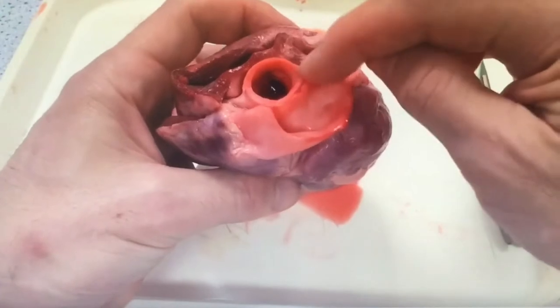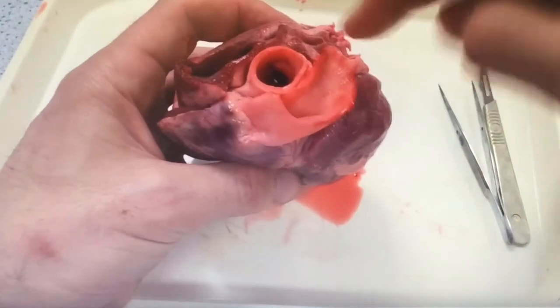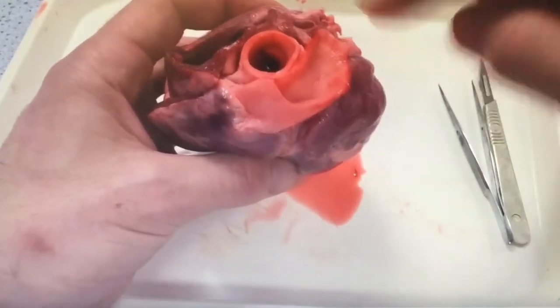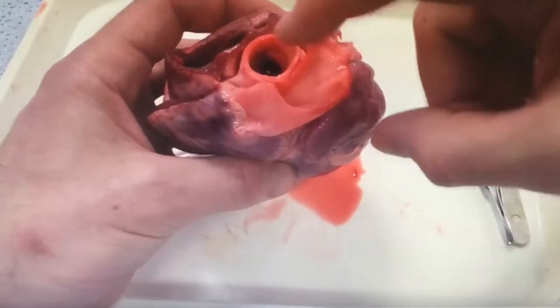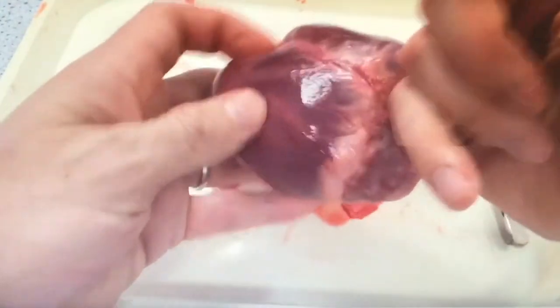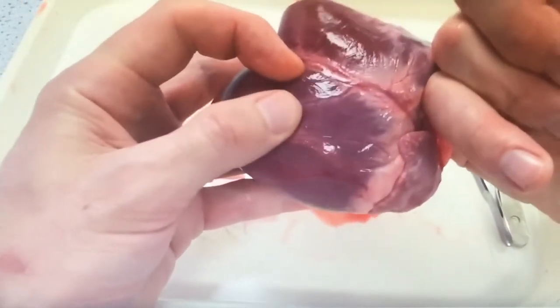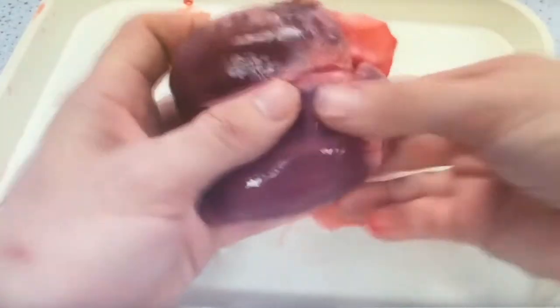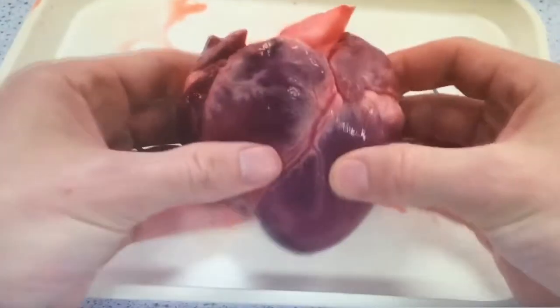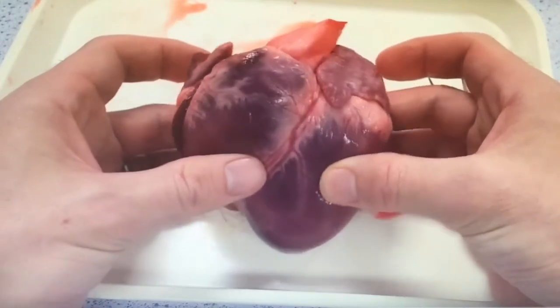Comparing that to this blood vessel here, which is still very much intact — you can see the thick muscular wall — that is the aorta. That is your main blood vessel that carries blood under high pressure around your body. Sticking your finger in that, you'll go right into the left ventricle and you can feel with your other finger how thick that muscular wall actually is.